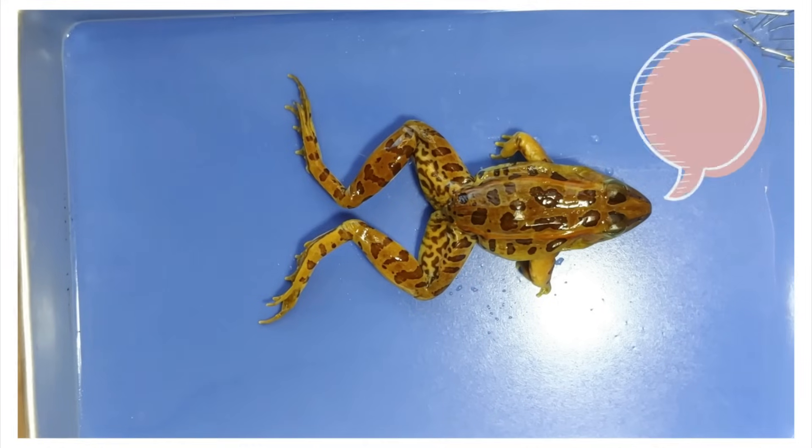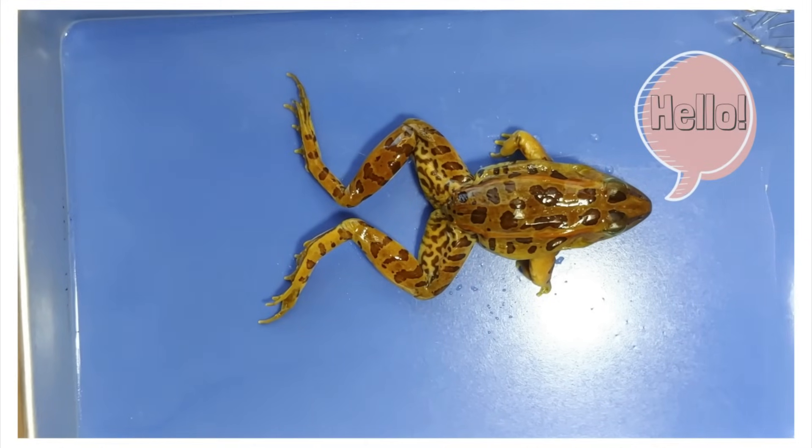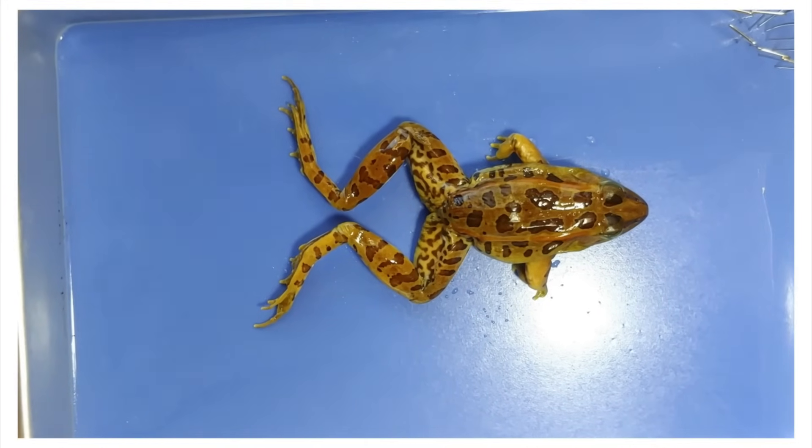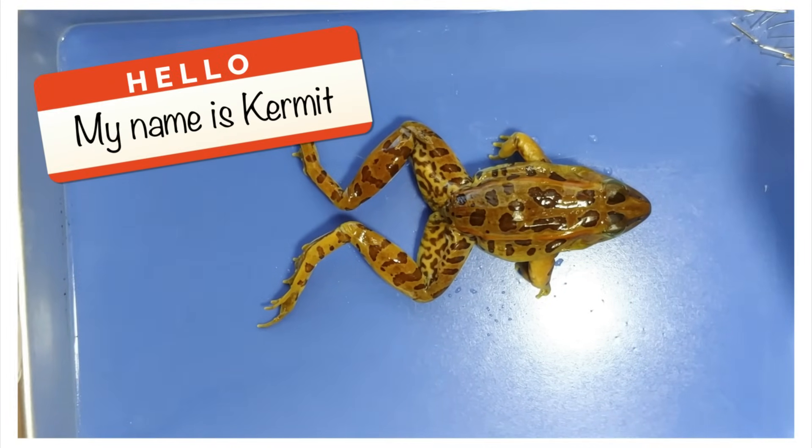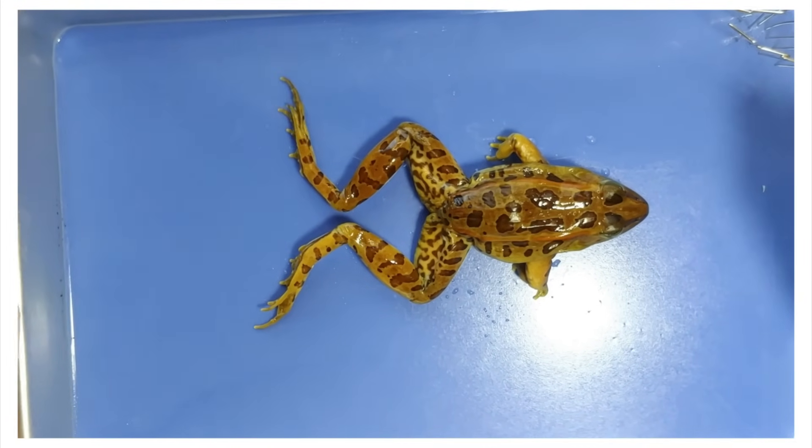Hello and welcome to Oh Worm. Today we'll be looking at the anatomy of a frog. Our guest for today will be named Kermit after Edith Kermit Carol Roosevelt, the second wife of US President Theodore Roosevelt.